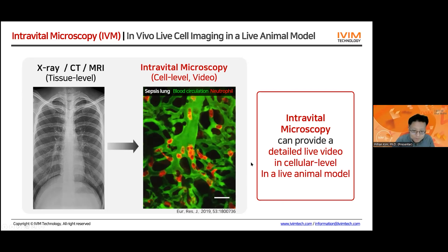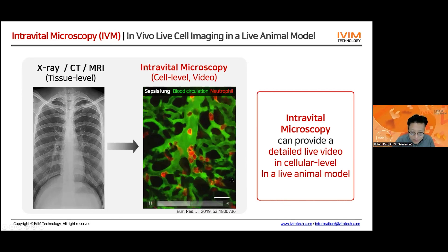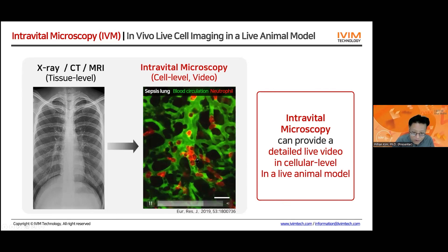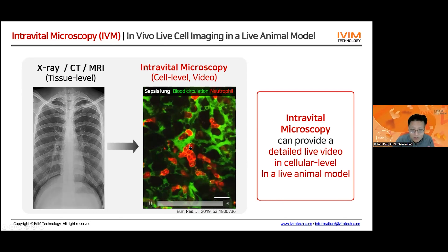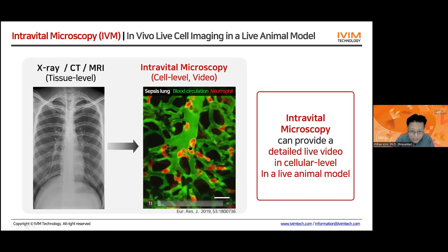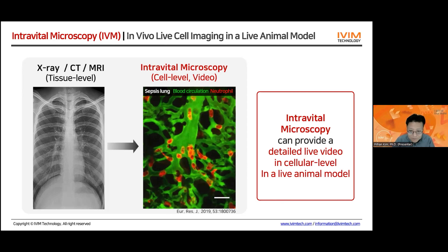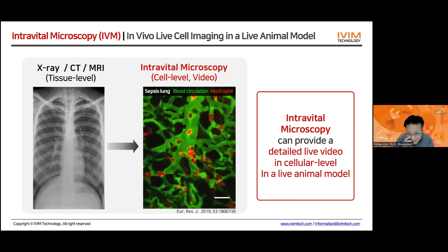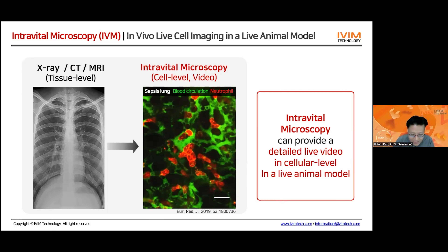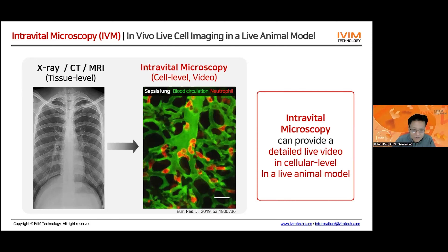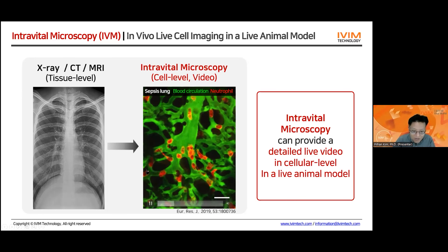In this video, you can see the neutrophil is very active — they move very actively. Then suddenly it makes a small cluster in the middle and blocks the arteriole. The neutrophil cluster fully disturbs and stops the blood flow. This is one of the key cellular-level dynamic events happening in the sepsis mouse model.